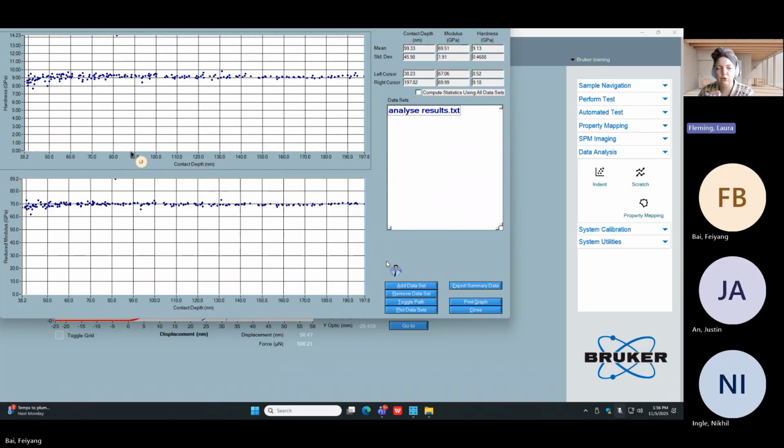Okay, so now two questions. One, do the results matter here? Should I expect them to be correct? Yes. Second question, are they? What do we think? The reduced modulus is very close. Which it should be, right? Because we defined that to be close. That was the tool that we used to get our correct hardness modulus.